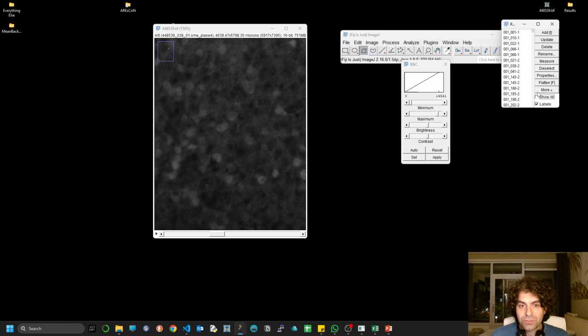This is a work that took me months to achieve, and it's going to incorporate more properties. As I told you, one of the goals is to include these estimations of regions, again taking outputs from other pipelines. And what I also want to do, and that's going to be done very easily because I've done it in the past in other pipelines, is, in this case where we have 2 channels, to also get the overlap. That's something that can be done within 1 or 2 days, to get the overlap based on a percentage that you dictate of these 2 channels.